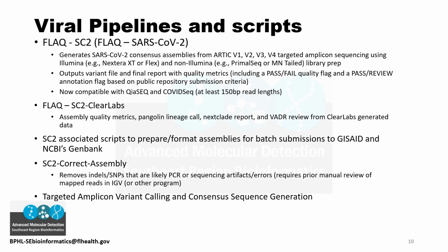And then during this training, we have a couple scripts that help automate the formatting of your FASTA files and doing sample review for SARS-CoV-2 data submissions, which we'll be going over in that training. We also have a script, we'll be going over this in part 5, that will provide assembly correction. So if you identify something that appears to be a PCR sequencing artifact that needs to be removed from the assembly prior to submission, we have a script that automates that as well.